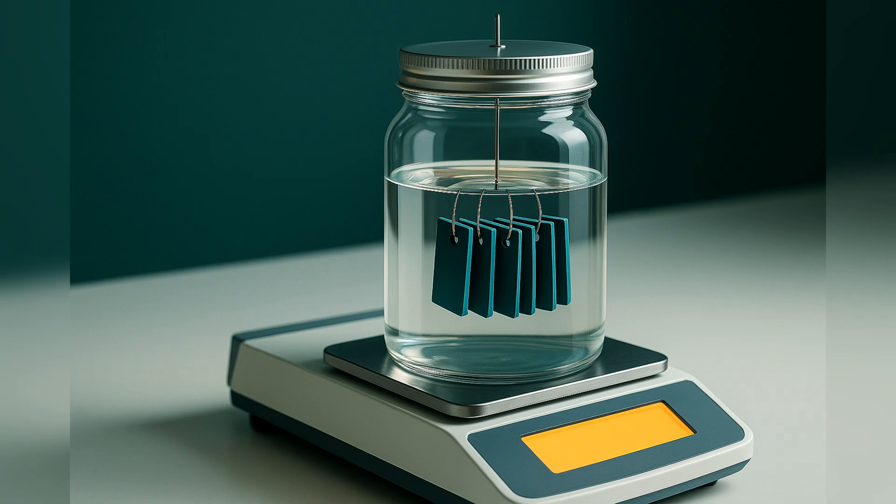You leave the sample in the solvent, usually at room temperature, for a set time — often 24 or 48 hours. During that time, the solvent diffuses into the rubber and the sample expands. At the end, you take it out, blot the surface quickly, and weigh it again. Now you have two numbers: the dry weight and the swollen weight. The difference tells you how much solvent has been absorbed. You can also measure the dimensions before and after if you want volume changes.